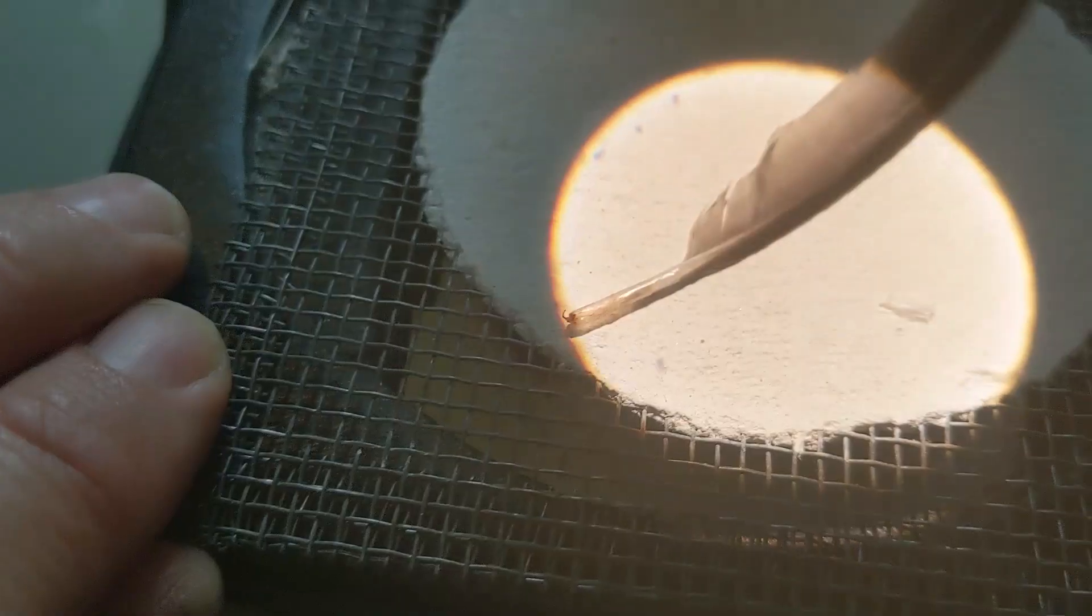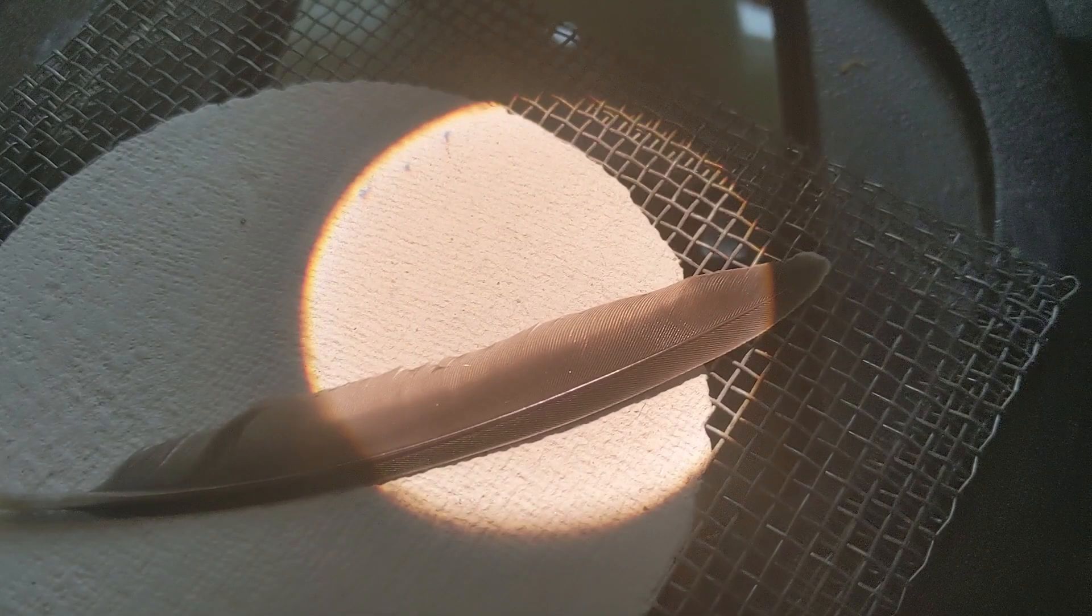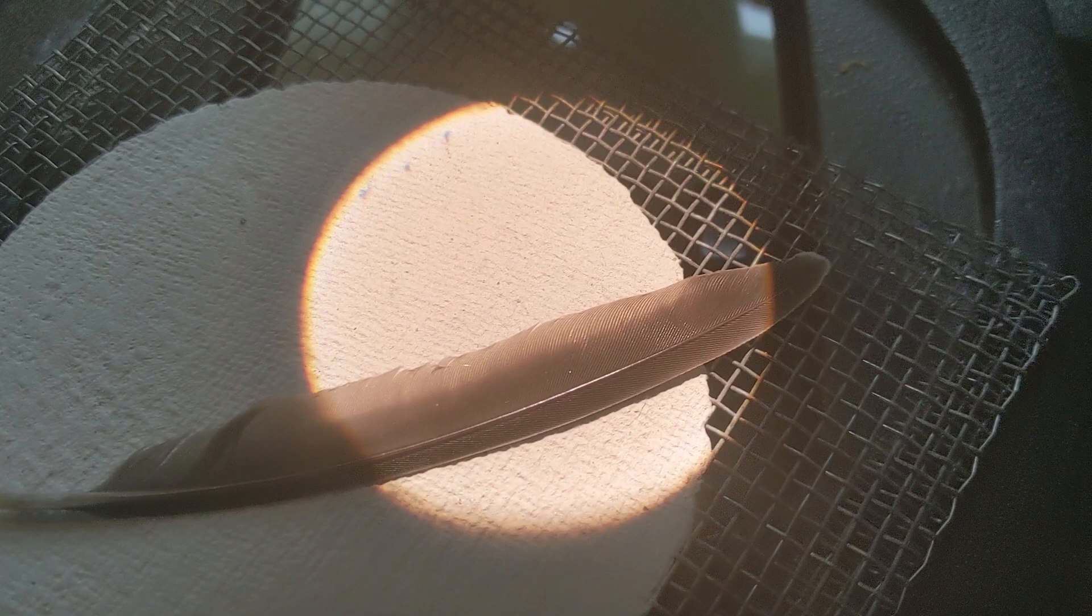Today we're going to take a look at a couple of feathers. This is a primary feather, a flight feather from the wing, and you'll notice that there's a shaft there. It's not quite in the middle, is it?